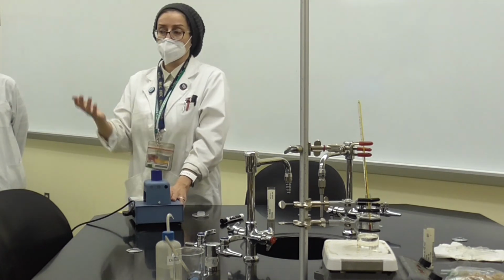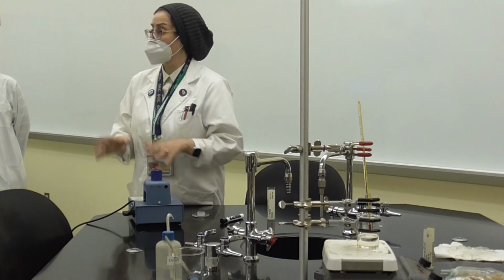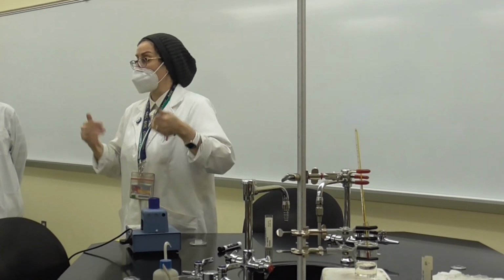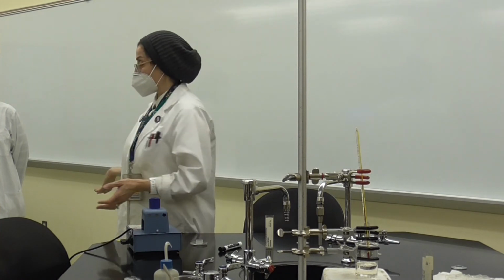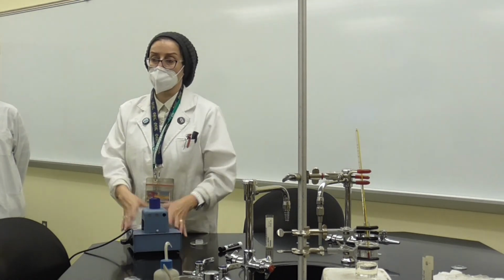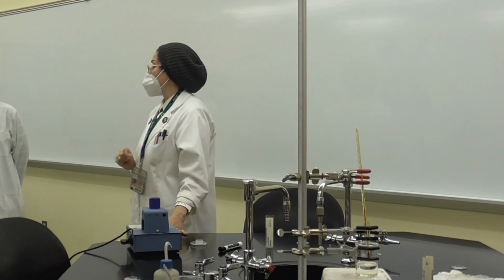Then from the melting point, we take it to spectroscopy to make sure that we prepared what is required. The melting point will take us to the reference and tell us approximately whether what you prepared has the correct melting point, and then we'll take it for further analysis. So this is what we're going to do today.